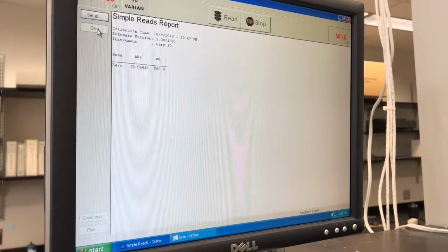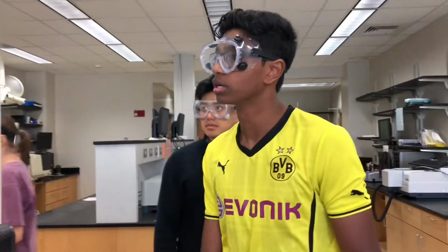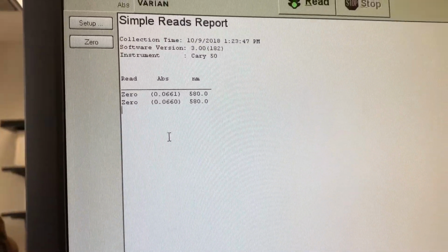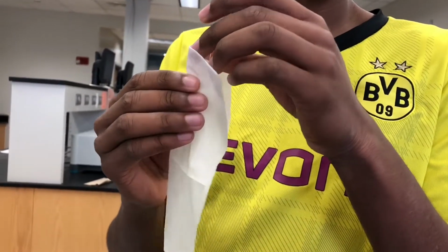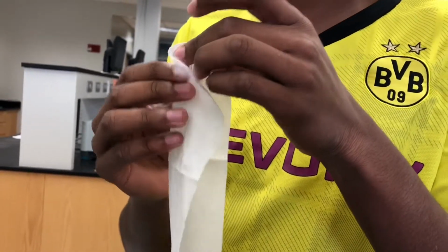We used water as a blank in the spectrophotometer and put it in and pressed 0 on the computer to find the absorbance of a clear substance so we could subtract that from our other solutions. We wiped 2 sides of the cuvette to make sure the spectrophotometer could read the visibility of the solution properly.